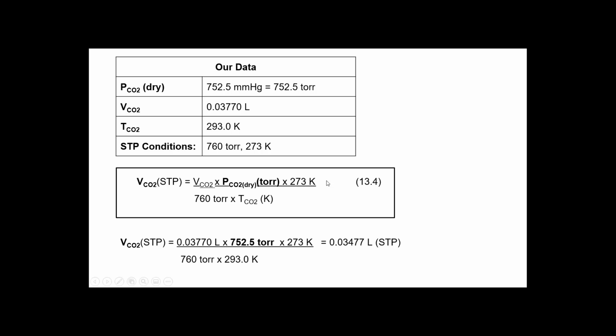So here's our data. This is everything that I collected from that page. This is the data that we're going to plug into our combined gas law. So there are already some numbers here. These are STP conditions. We do not have the STP conditions for this gas. If it was under ideal conditions, for an ideal gas law, it's 22.4. Oh, sorry, no, this is molar volume. Forget I said that. This is volume. I'm getting one step ahead, and I'll repeat that when we get to that equation. We don't have this one right here.